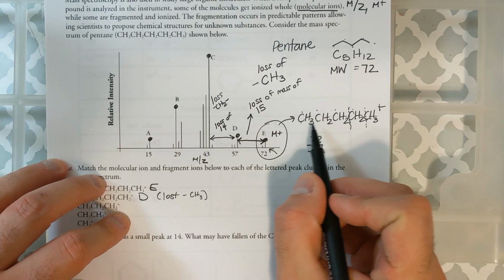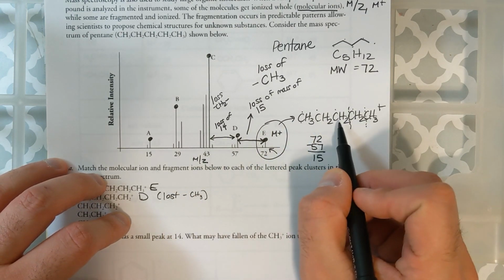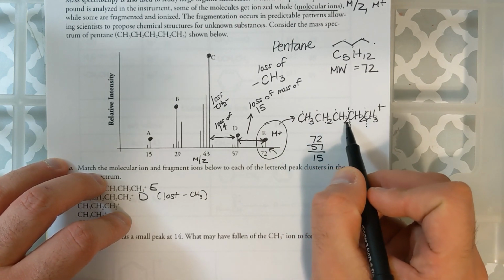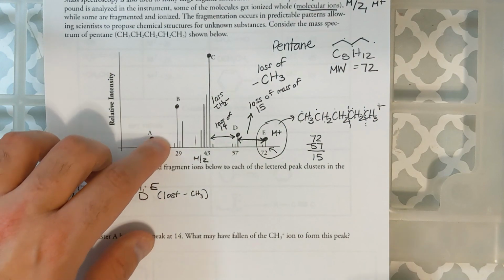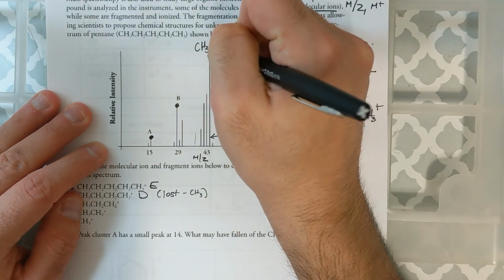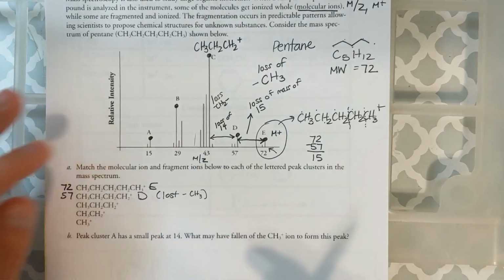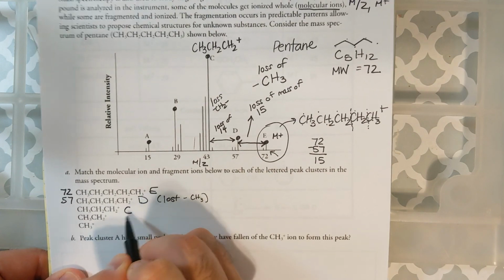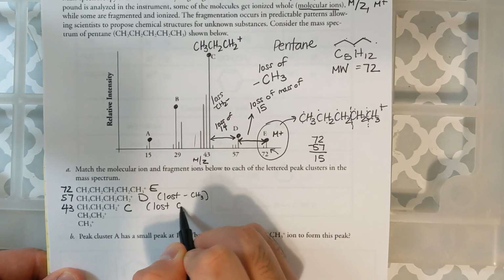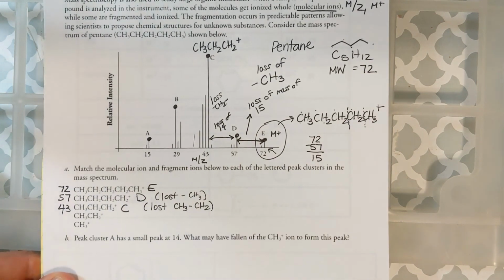So now I'm going to be left with these 3 carbons, and this is going to be a mass of 43. 3 carbons is 36, 37, 38, 39, 40, 41, 42, 43. This M43 peak is going to be CH3, CH2, CH2 plus. That is what is at peak C. And this has a mass of 43. I lost CH3 and a CH2.